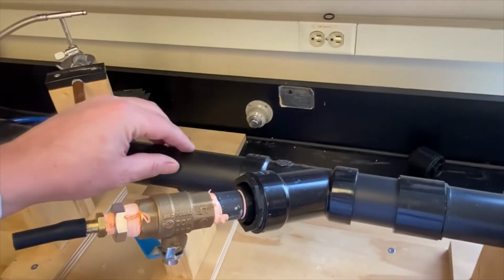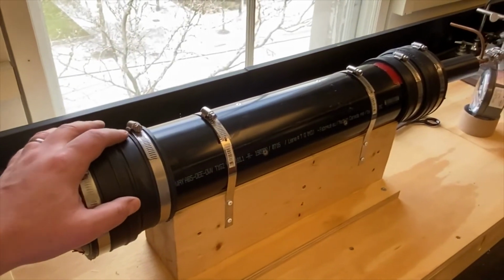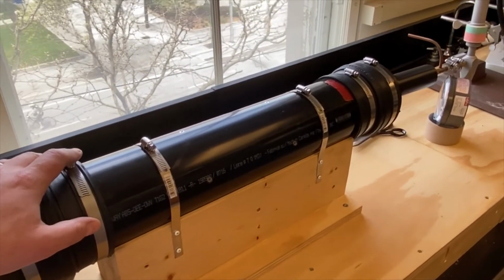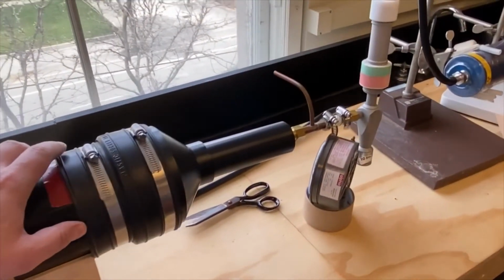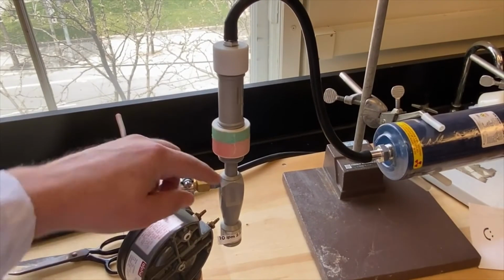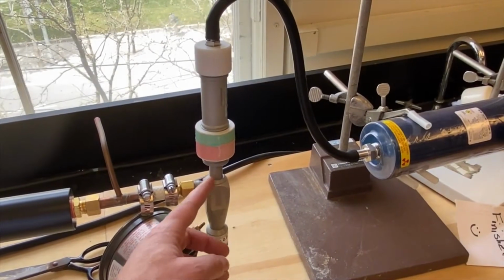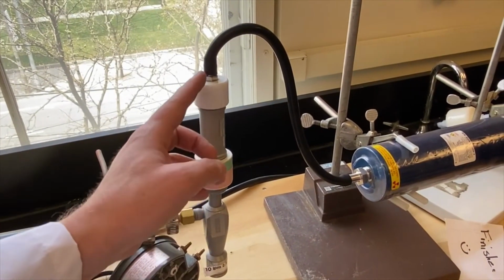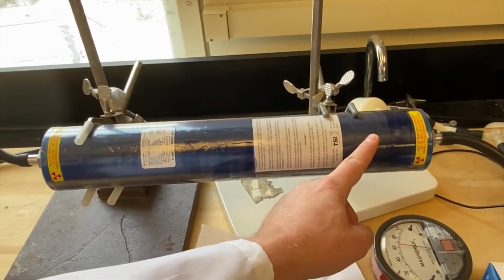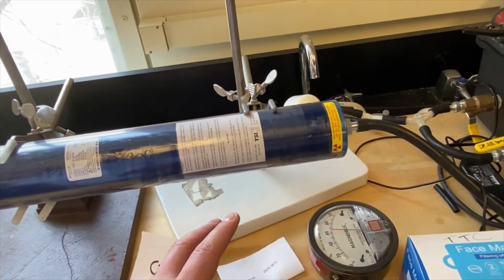The salt droplets are then brought into the air, and that's passed into this long mixing chamber that has baffles in it. That makes sure that all of the liquid in the salt solution evaporates, and all we're left with is salt dust. And from there, the salt particles are passed through a cyclone, and this cyclone rapidly spins particles around so that the very large ones come out at the bottom, because all we're interested in are the very fine salt particles. And then those are passed through this long tube that contains a jacket of a radioactive material, and passage through this causes any electrostatic charges on the particles to be neutralized.